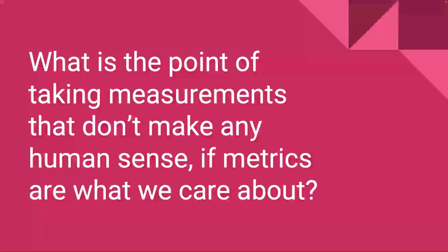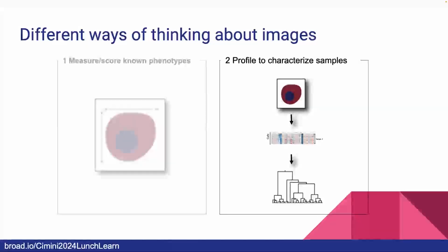But again, if we can't use them in the end because they don't make any sense, why am I telling you this? Why am I wasting your time? And that gets us into the last part of the talk, which is about image-based profiling. It's about using all of those pixels.